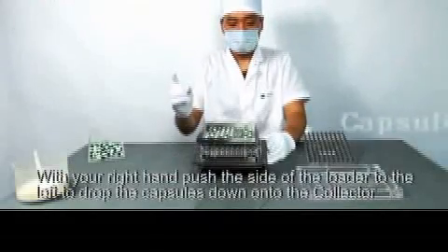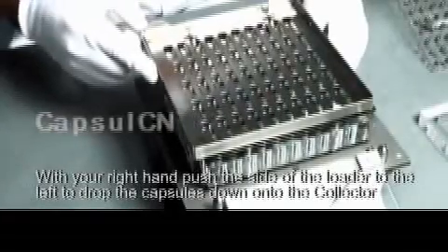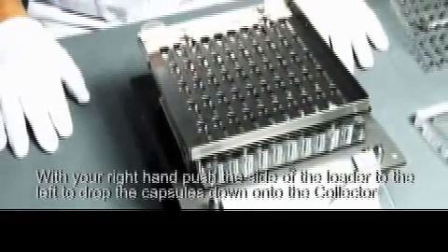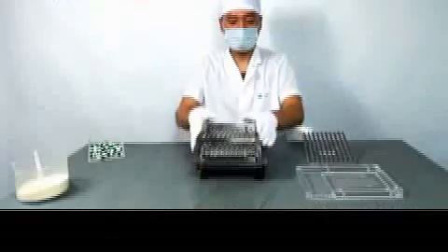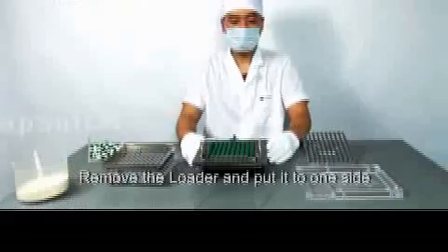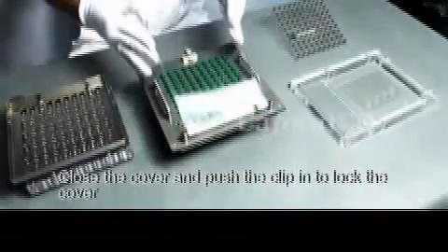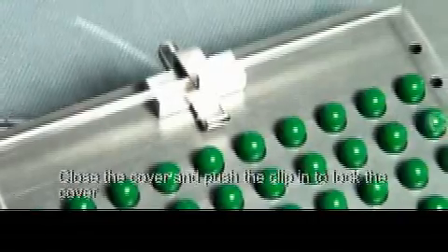With your right hand, push the side of the loader to the left to drop the capsules down onto the collector. Remove the loader and put it to one side. Close the cover and push the clip in to lock the cover.